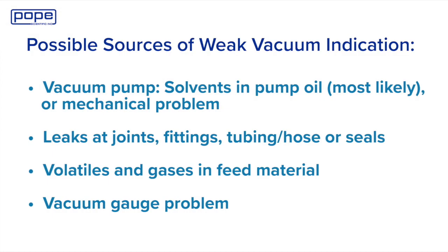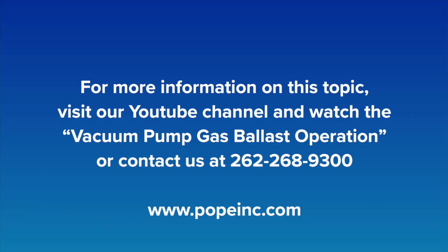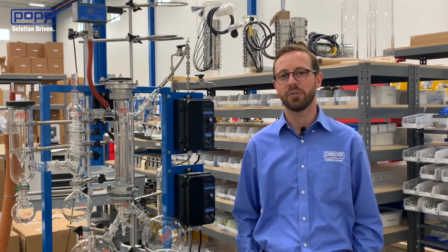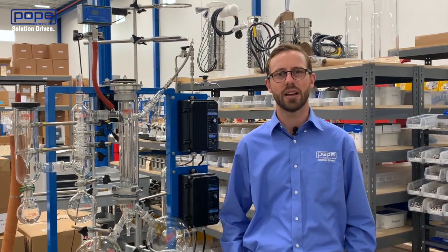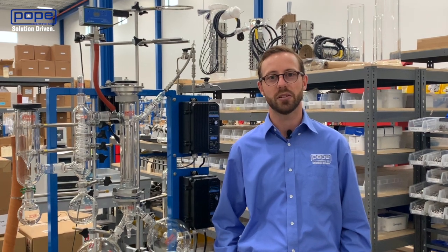There are several issues that can cause weak vacuum, such as problems with your vacuum pump or a leak at the joint, fitting, or seal. The inability to reach the rated ultimate vacuum with your vacuum pump may be a simple fix as we discuss in the linked video. Or you can contact Pope Scientific's team of technical experts for troubleshooting leaks. But what might be the case if your system is vacuum tight and you still have weak vacuum when you start to process your material?